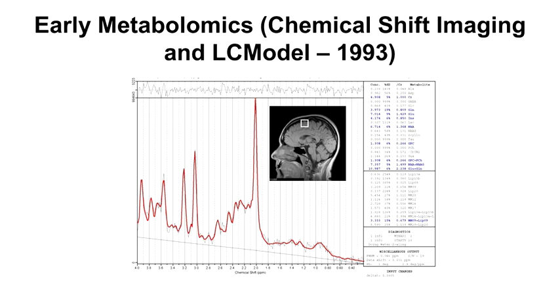Chemical shift imaging, or MRS, again, this is a development where you can look at the NMR spectra of samples in the brain or in tissues, and believe it or not, that is an NMR spectrum. It's a lower resolution, but you can deconvolve that and identify specific metabolites in there, about 10 or 15. And now with newer developments, you're able to get some strikingly good spectra with higher field MRI instruments.